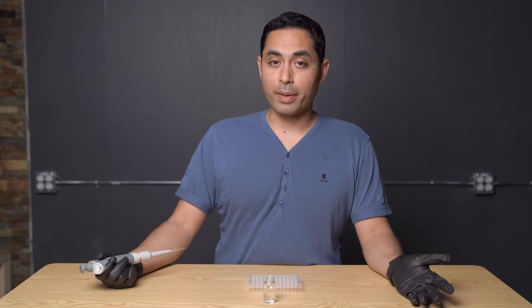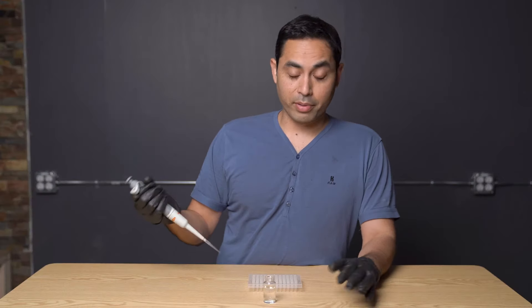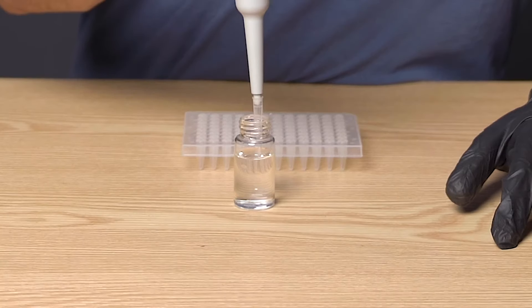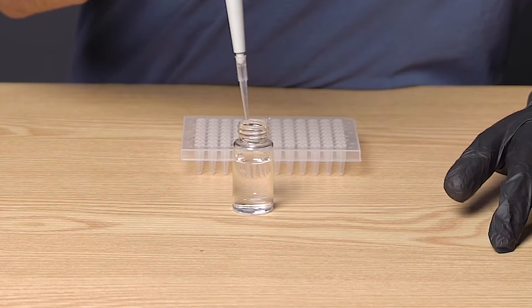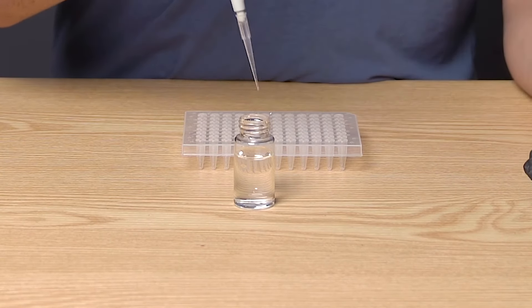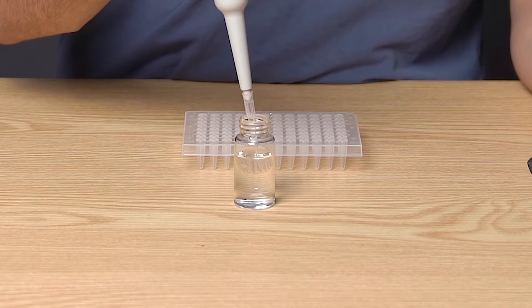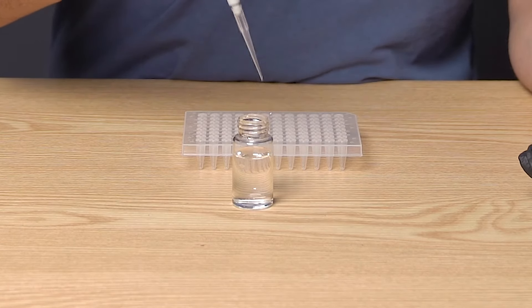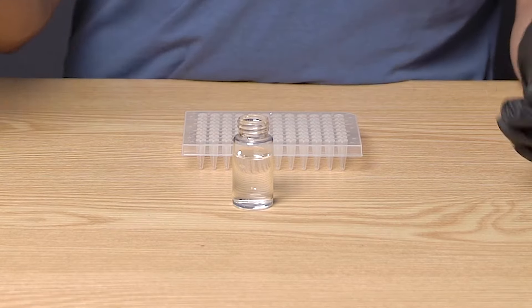The third thing you want to do is pre-wet your pipette tip if you can. What pre-wetting means is you put your pipette in and you aspirate and dispense a few times. That coats or lubricates the surface so that when you actually pipette your sample, you get a nice, accurate draw. Pre-wetting is a good practice.